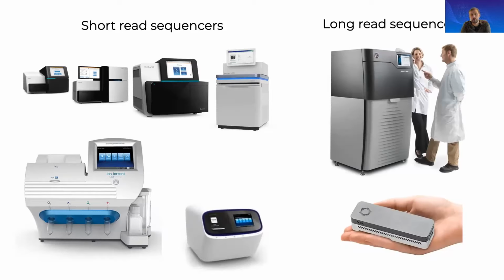The benefit of the short reads isn't that they're short, but that they can be very inexpensive, and they can be generated in a massively parallel manner, with billions being generated in a single run. So the cost is lower. And so when you need the cost to be lower and the count of reads, or your ability to cover a certain region with a high number of reads, is needed, short read technology makes the most sense.